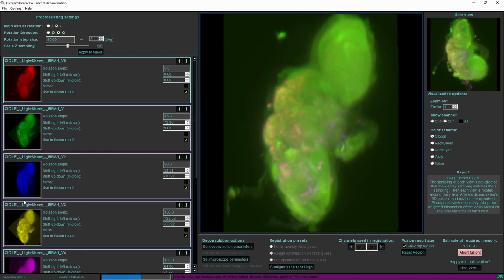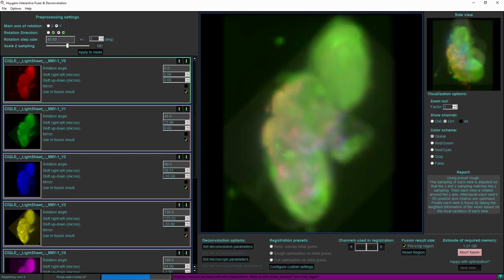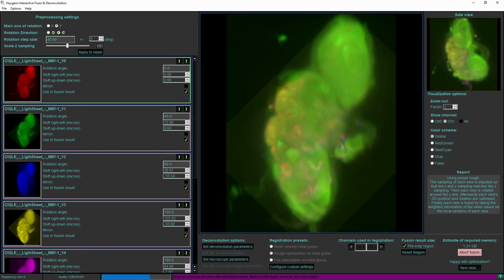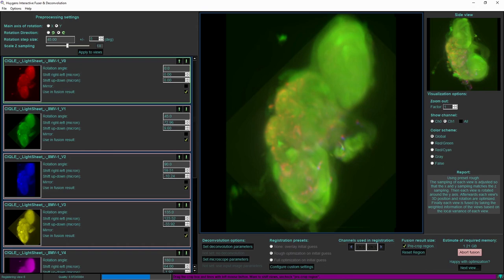Now the fusion itself tries to combine the best parts of each of the input images. For each location in the result Huygens will try to determine which of the input views contains the best information for that region. Usually of course that would be the side where the light sheet is coming from and the side where the detection objective lens is located.